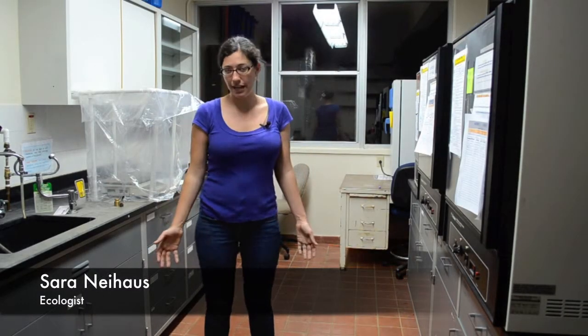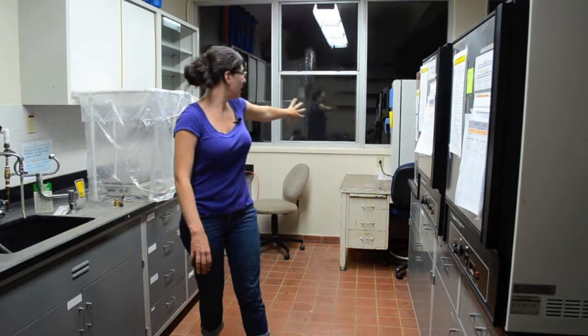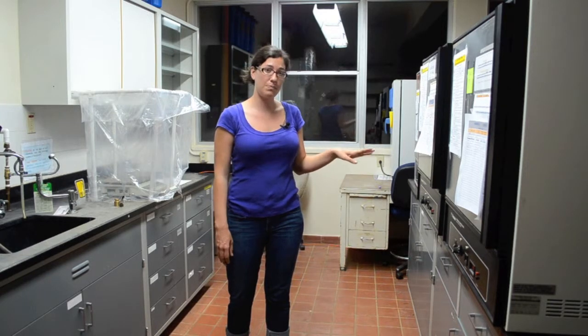Here we are in the laboratory. We have some samples in these ovens drying — all these boxes along here are our laboratory drying ovens. They're all set at 60 degrees Celsius to dry the plant material that we have in the samples, which we've washed and dried in the drying cabinet.